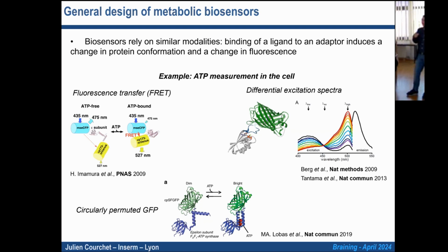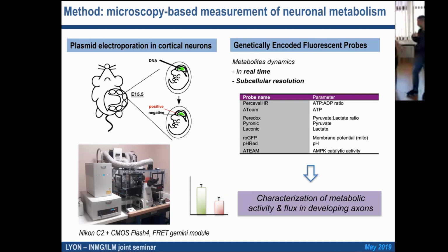The drawback is that this one is only one fluorescence, whereas with this, you have two lines of fluorescence, and with this, you have two lines of fluorescence. So you need one of the colors, you need some red, to be ratiometric and to normalize how much fluorescence you have in your cells, how much transcription you have in your cell. I will comment on that in one minute.